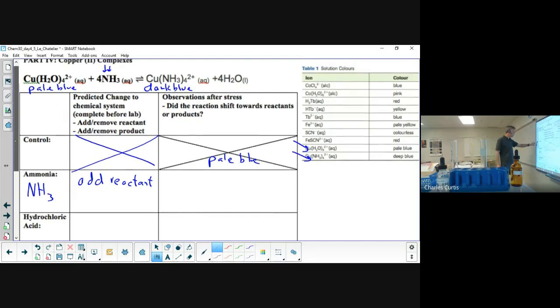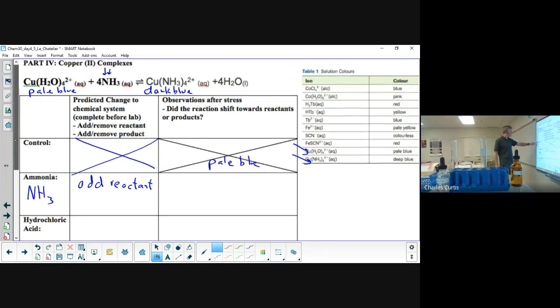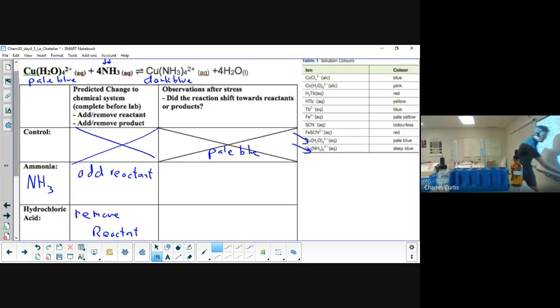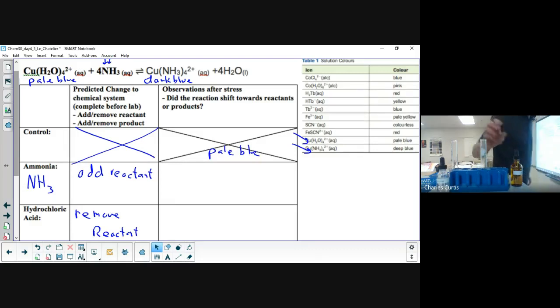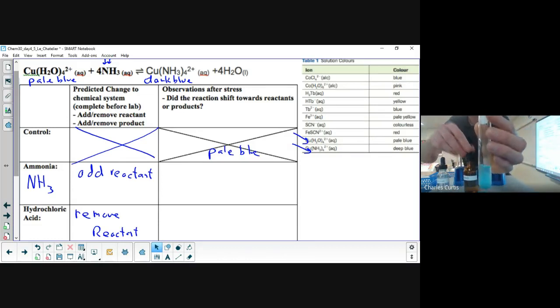So we're going to remove ammonia. We're going to turn ammonia into ammonium. So because ammonia is a reactant, we're going to remove that. Okay. We won't have NH3 anymore. We'll have NH4. So let's carry these last 2 pieces out. So here's my equilibrium mixture. I'm adding ammonia first as a reactant, and we're looking for the darkness of the blue.